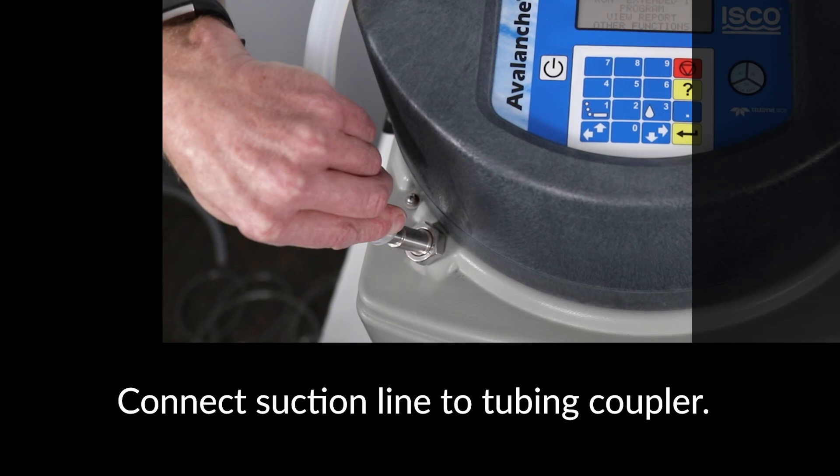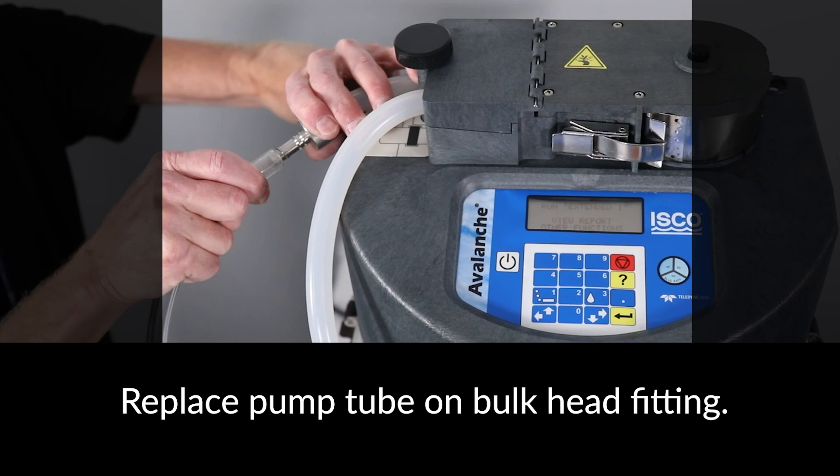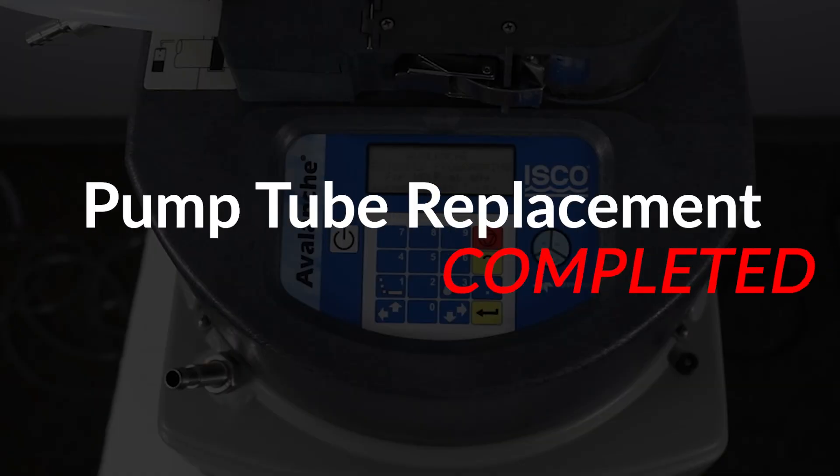After testing the pump operation, connect the suction line to the tubing coupler. Replace the pump tube on the bulkhead fitting. Pump tube replacement is now complete.